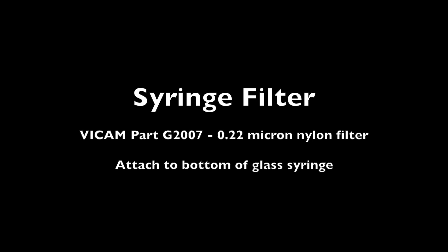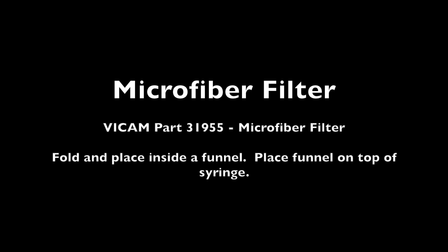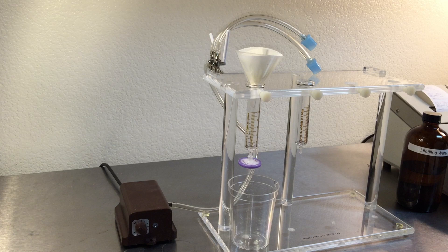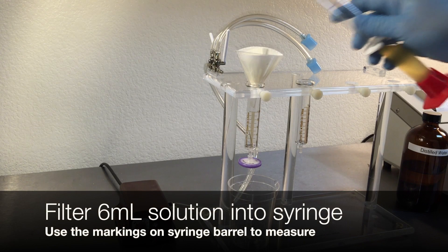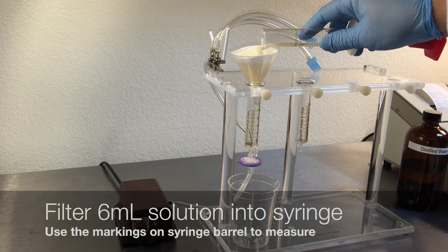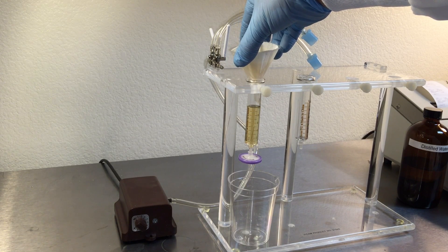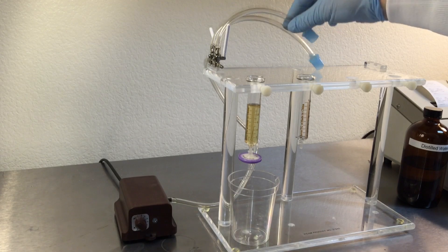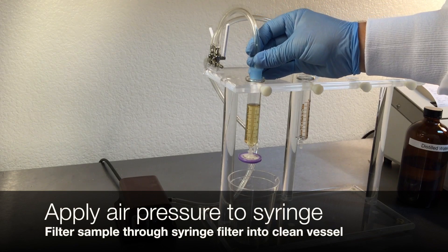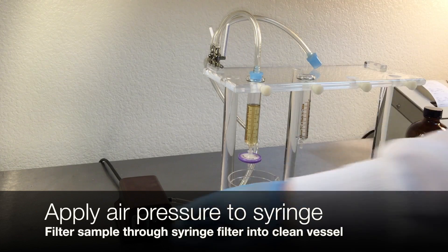Attach a syringe filter to the bottom of the glass syringe on the pump stand. Fold and prepare a microfiber filter and place inside a funnel, then put the funnel on top of the syringe barrel. Pipet or pour 6 milliliters of filtered extract into the syringe barrel — you can use the markings on the barrel to measure.